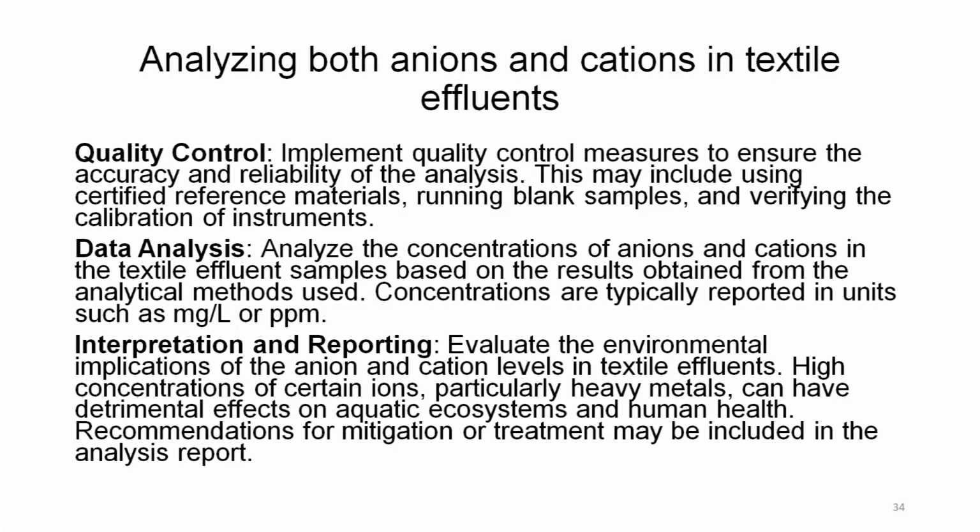Therefore, it is important that these analyses are done in a very accurate manner. Emphasis on accuracy and calibrated machines, and the analysis to be carried out on these calibrated machines, is repeatedly emphasized. Why?